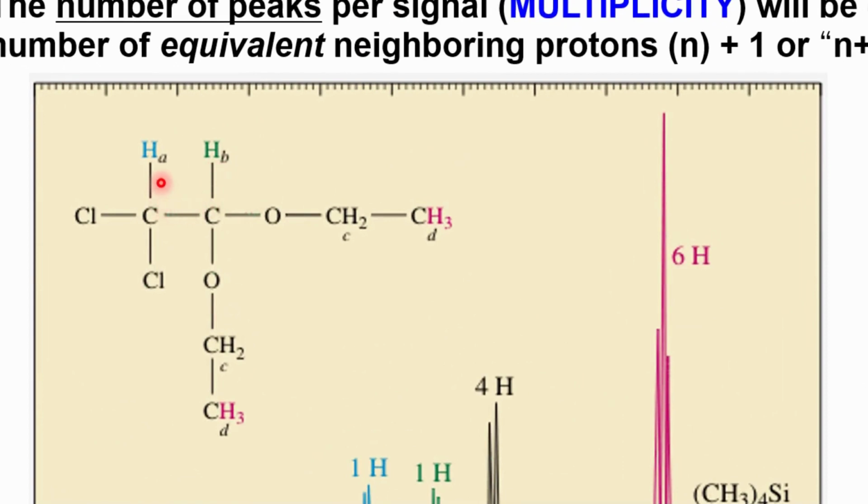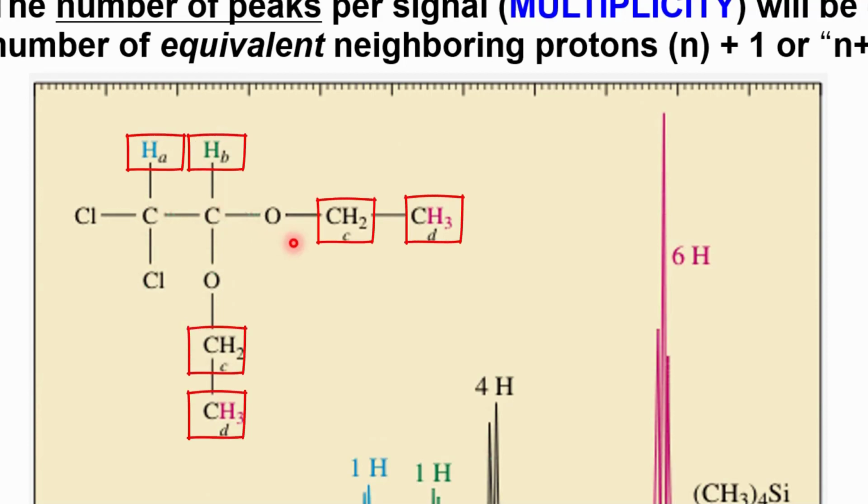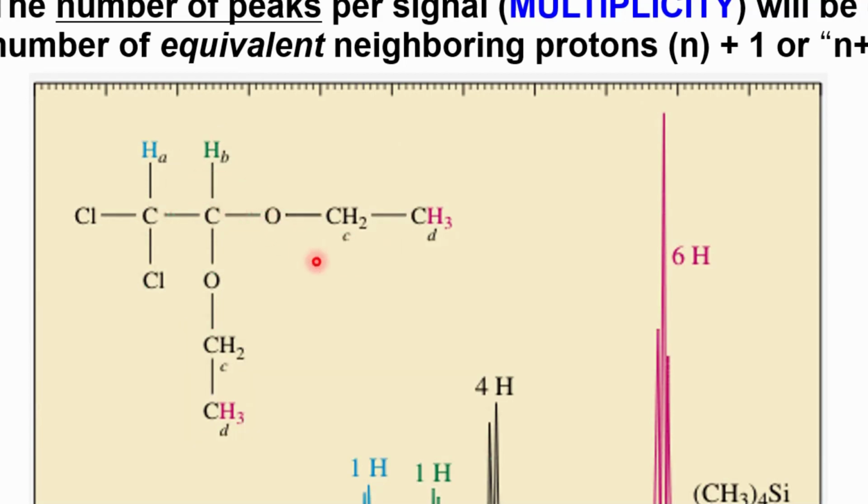All of the proton environments in this given molecule have a colour and a letter. This is for reference, and you are encouraged to do the same when elucidating a structure of an organic molecule. The displayed formula used for the molecule in this example doesn't make the symmetry obvious, and so we need to look at the connectivity of the protons in these groups to see if the protons in a particular environment are equivalent to those elsewhere in the structure.